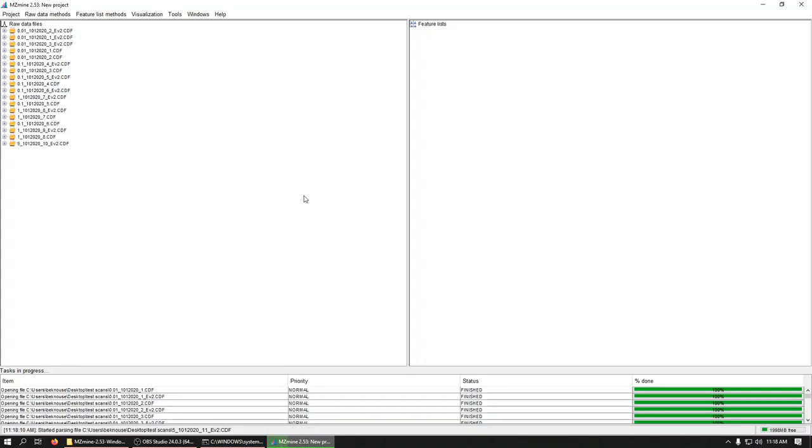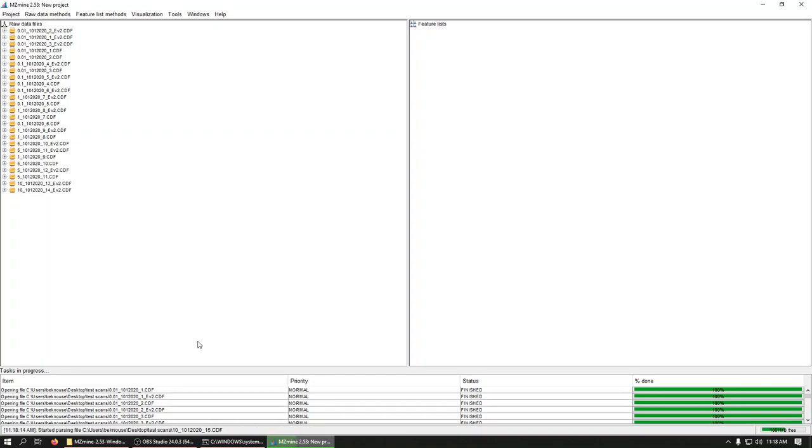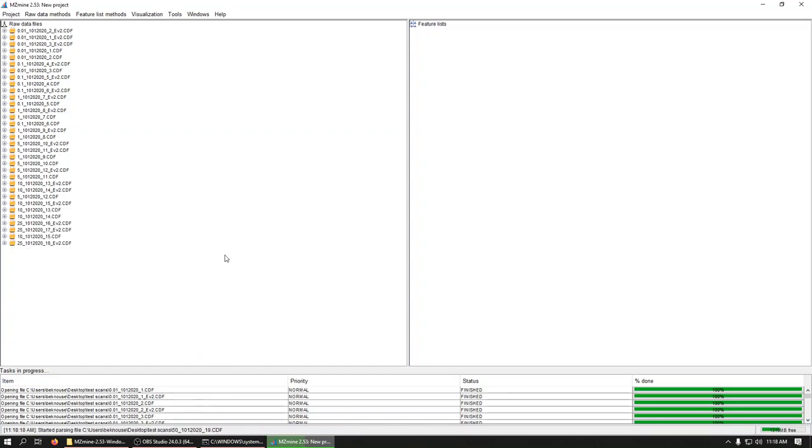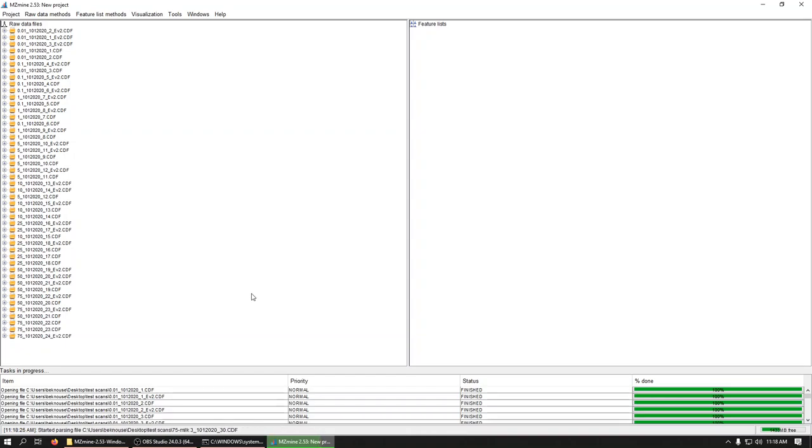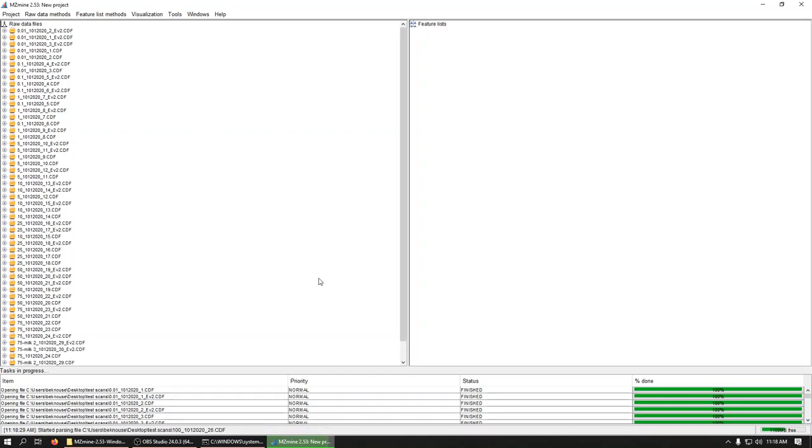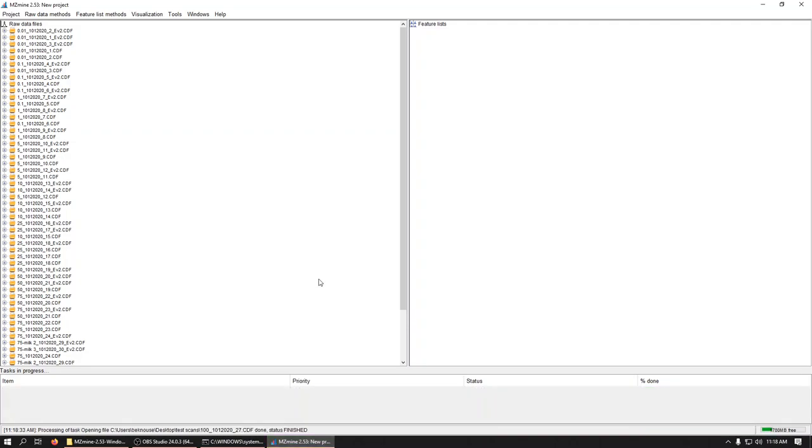So we wait. And we wait. Ding. We're done.